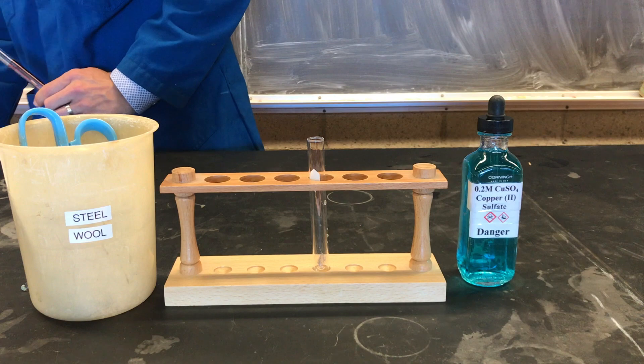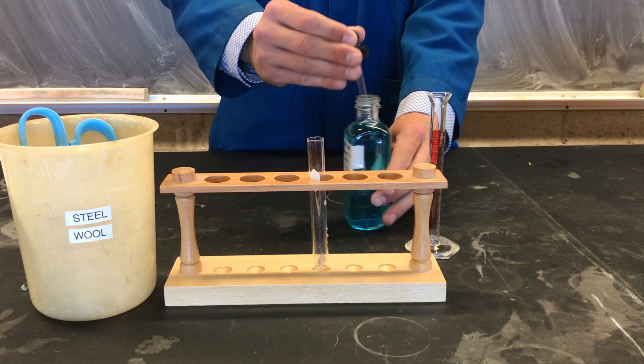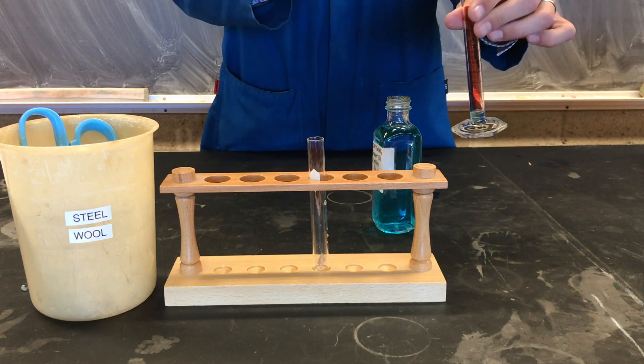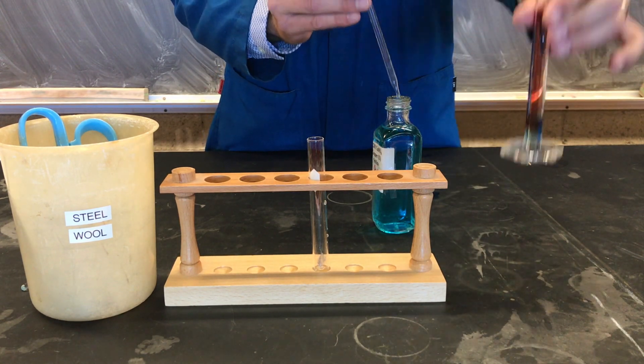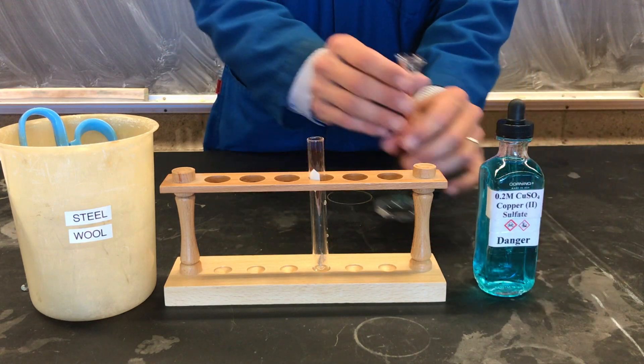We'll then add about 2 ml of our copper sulfate solution to a 10 ml graduated cylinder and add it to our test tube.